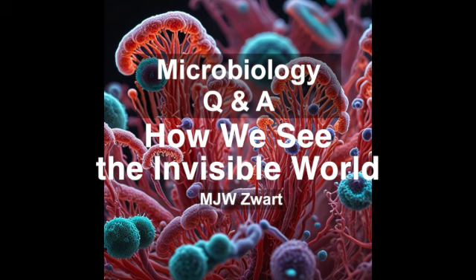Precisely. That's amazing. And then there's fluorescence microscopy, which is even more specialized. It uses fluorescent dyes that bind to specific molecules within a cell. When you shine a specific wavelength of light on the sample, these dyes emit light of a different color. So they glow. They make the targeted structures glow against a dark background. It's like highlighting specific parts of a cell with different colors. Exactly. What a powerful tool. It is. And these are just a few examples of the many types of light microscopes we have today. Each has its own strengths and applications, allowing us to explore the microscopic world in incredible detail. So light microscopy is all about manipulating light to reveal the invisible.